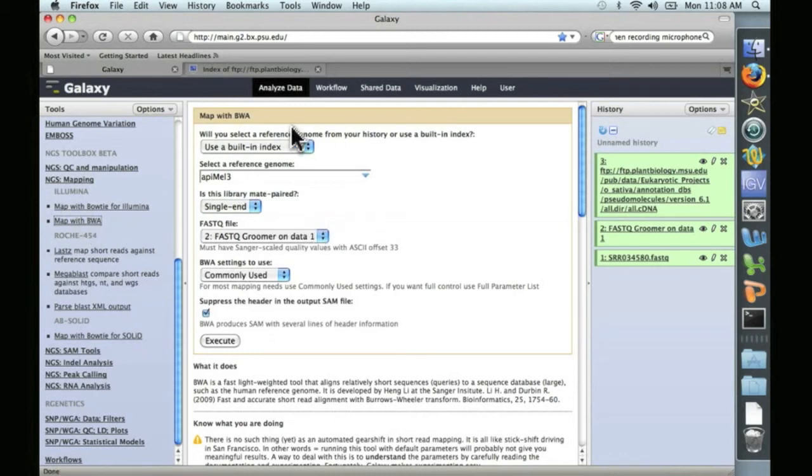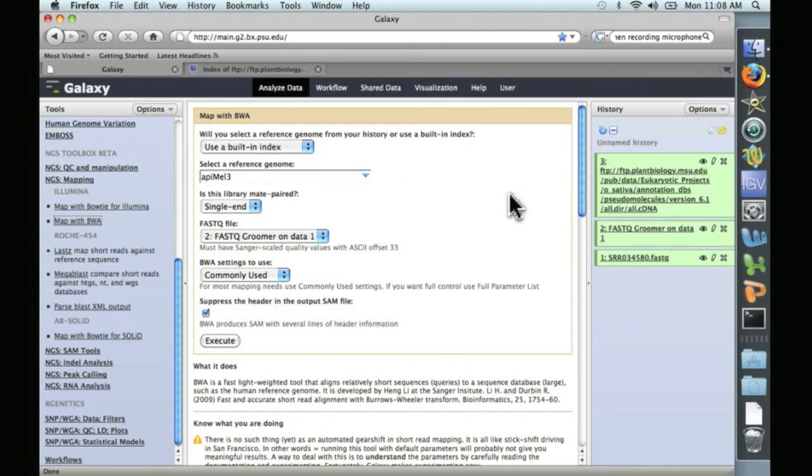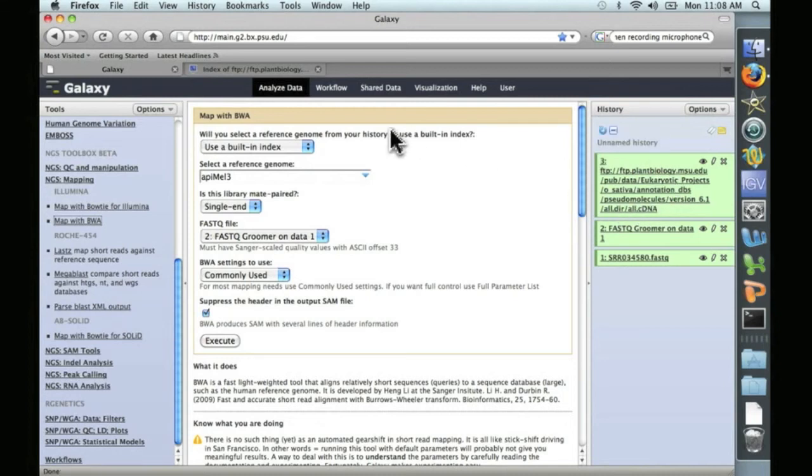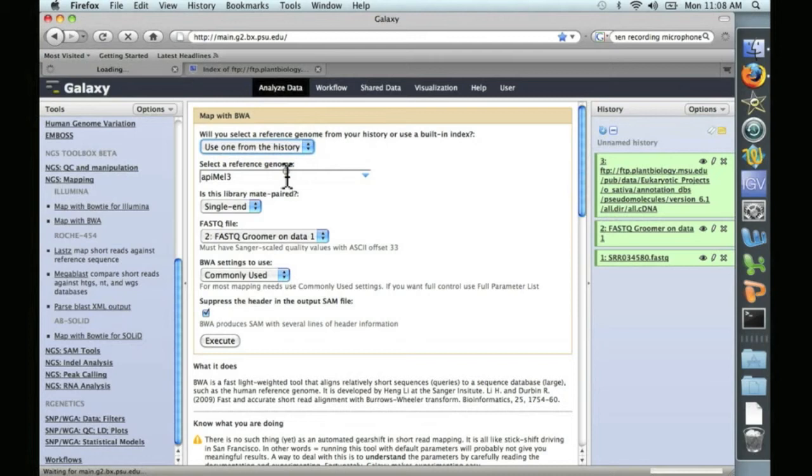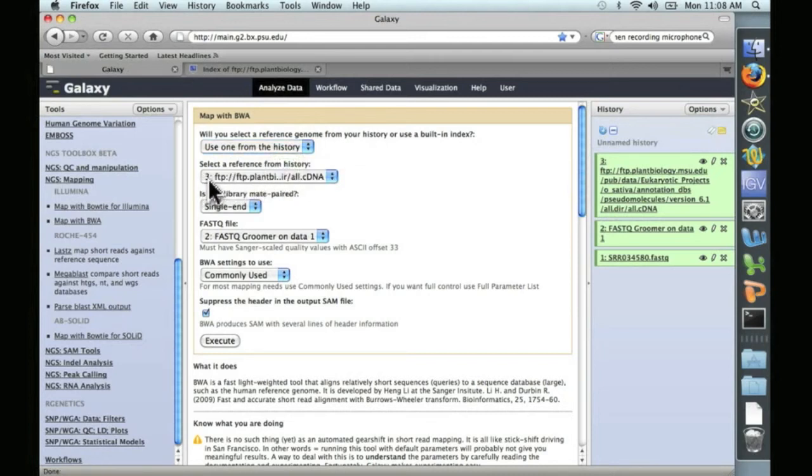And the first option we have is to use a built-in index or a reference genome from our history. And so we want to use a reference genome from our history. That's this cDNA database we just uploaded. So we click on Use One from the History, and it automatically finds that. And this three, this number three, refers to this number three, this object in your history.